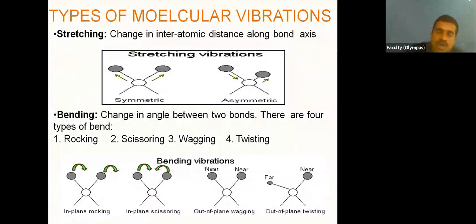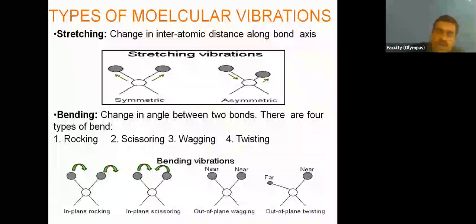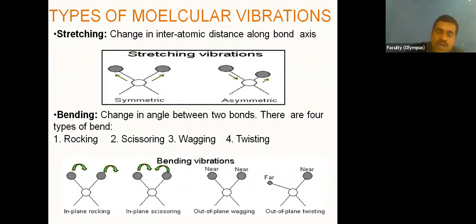At the same time, both atoms are stretching and elongating. That is called symmetric stretching vibration.